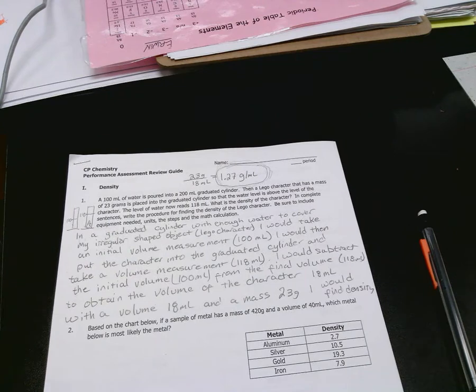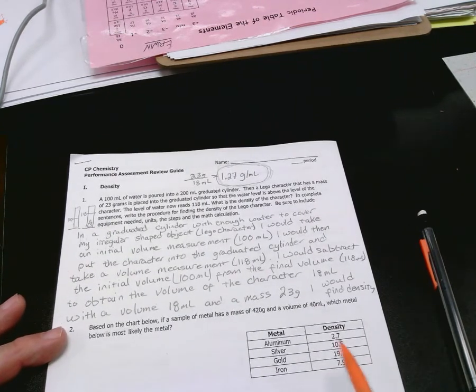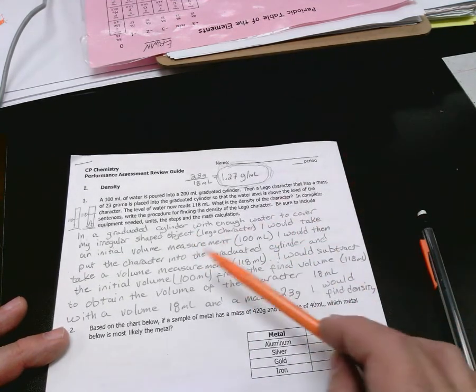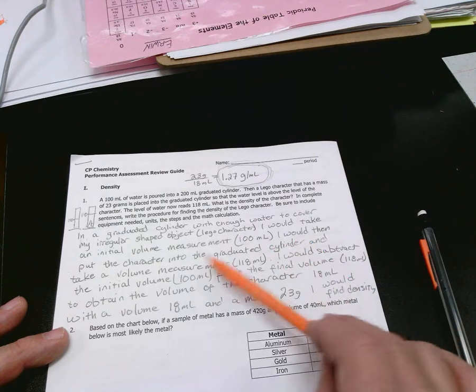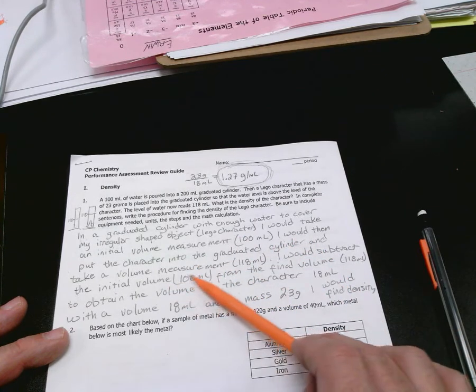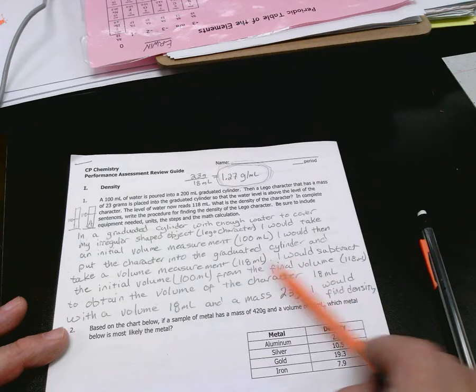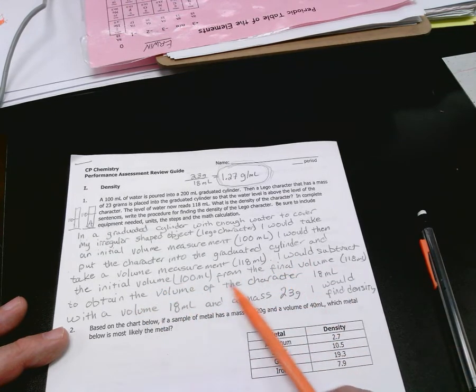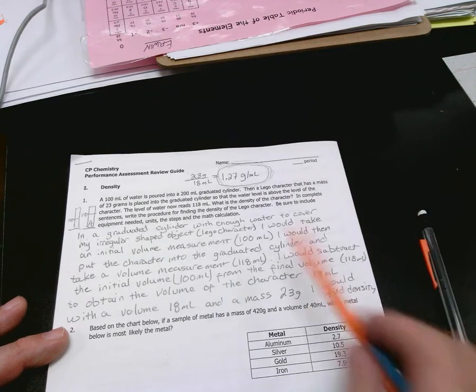Okay, so I wrote all that out. Hopefully you can see and read that. I guess I will read it. In a graduated cylinder with enough water to cover my irregular shaped object, the Lego character, I would take an initial volume measurement, 100 milliliters. I would then put the character into the graduated cylinder and take a volume measurement, 118 milliliters. I would subtract the initial volume, 100, from the final volume, 118, to obtain the volume of the character, 18 milliliters. With a volume of 18 milliliters and a mass of 23 grams, I would then calculate density. That's pretty much all you're doing for this.